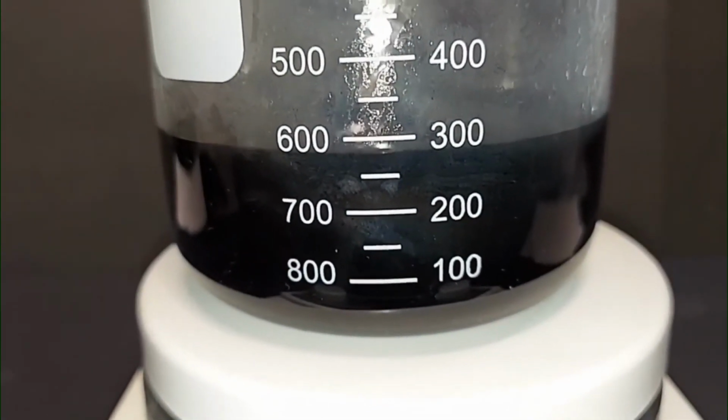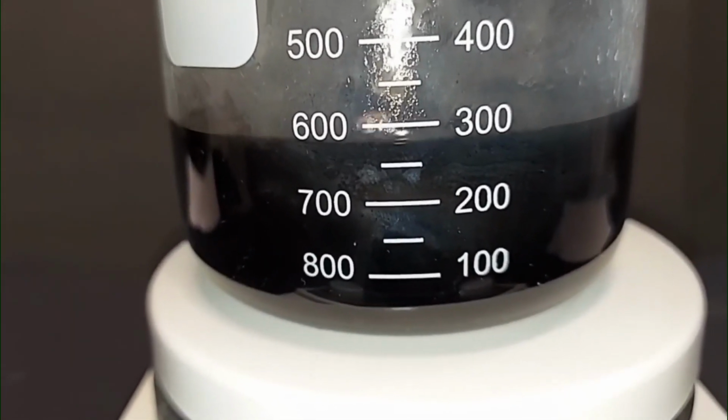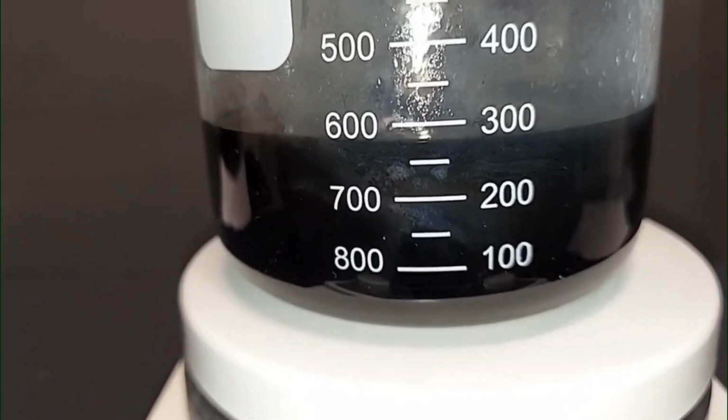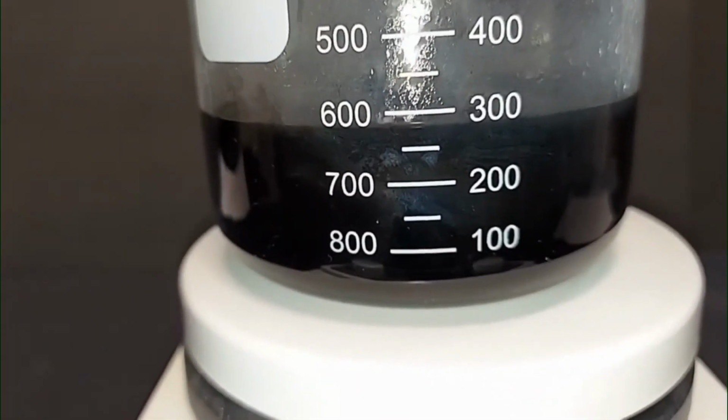crystallize it then. Well, my gut feeling was wrong. I should have gone with the numbers. You know why it's back on here? I didn't want to bore you with videos of something that didn't happen, i.e. the crystallization of copper 2 chloride. So I'm going to go down to the 210 milliliters I originally figured, and we'll go from there.